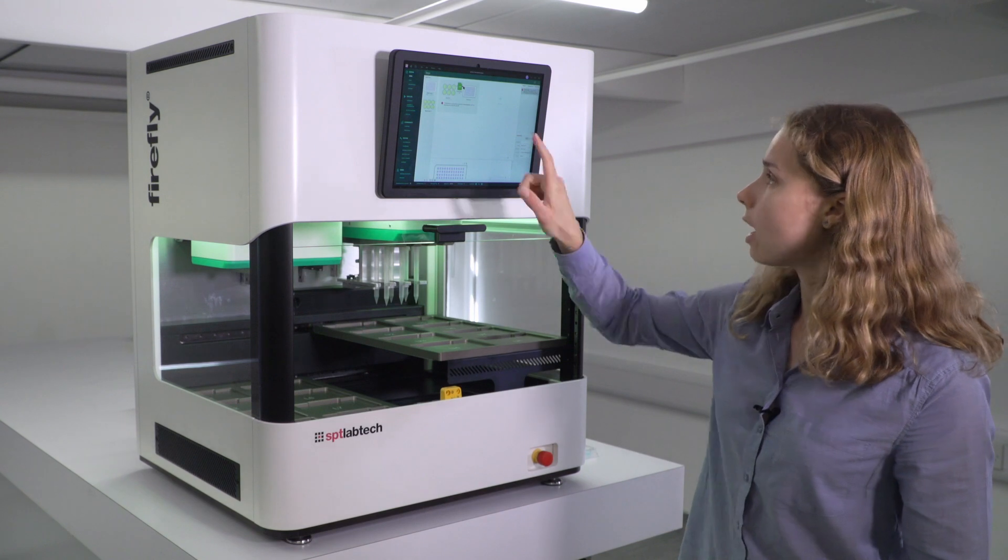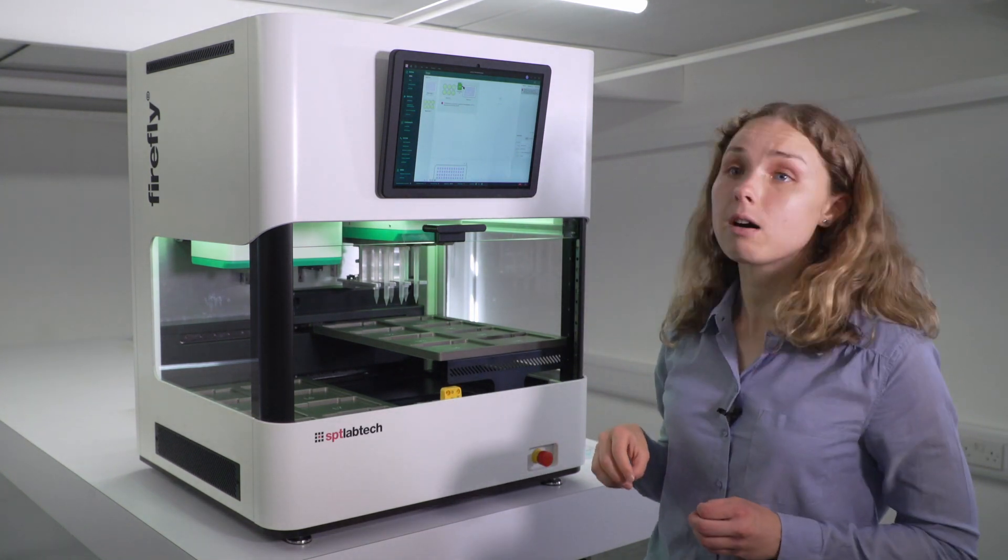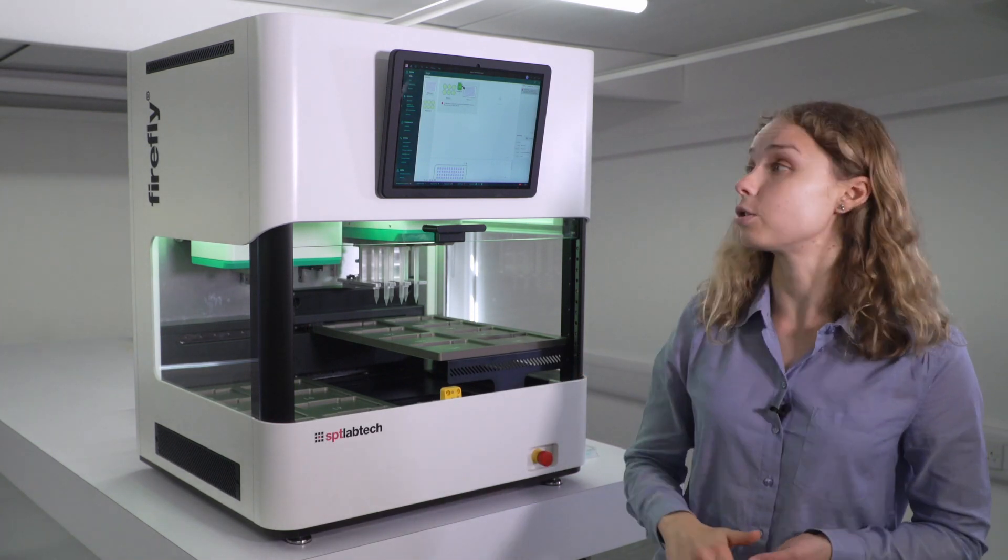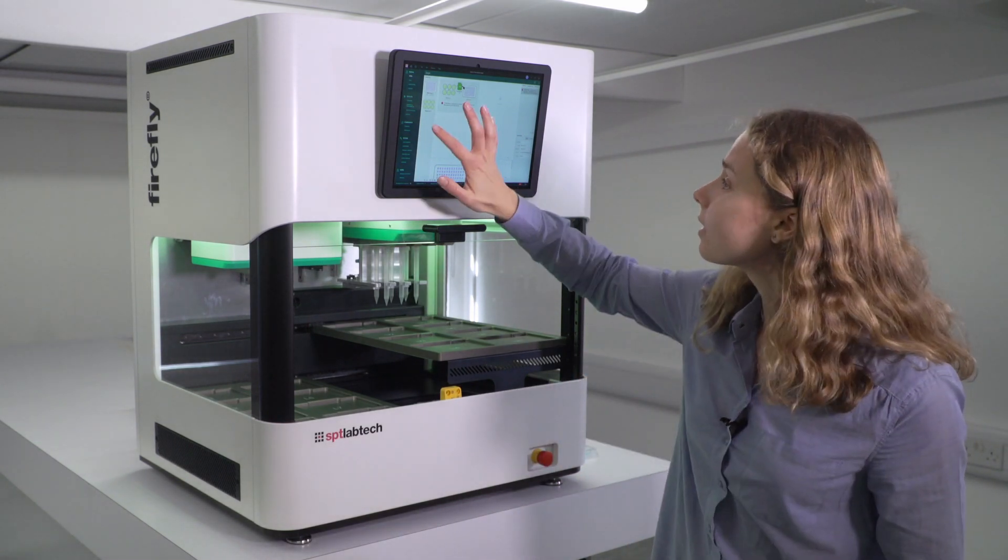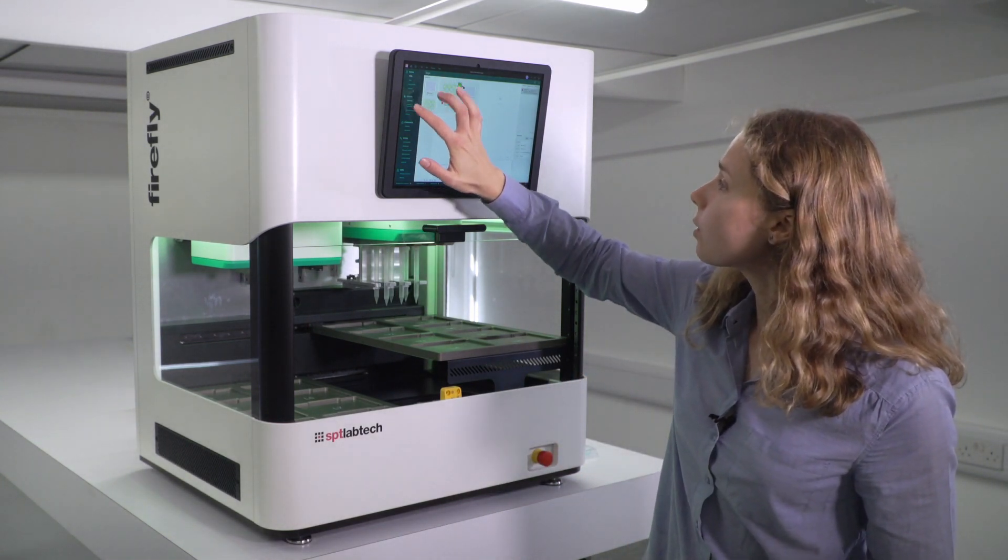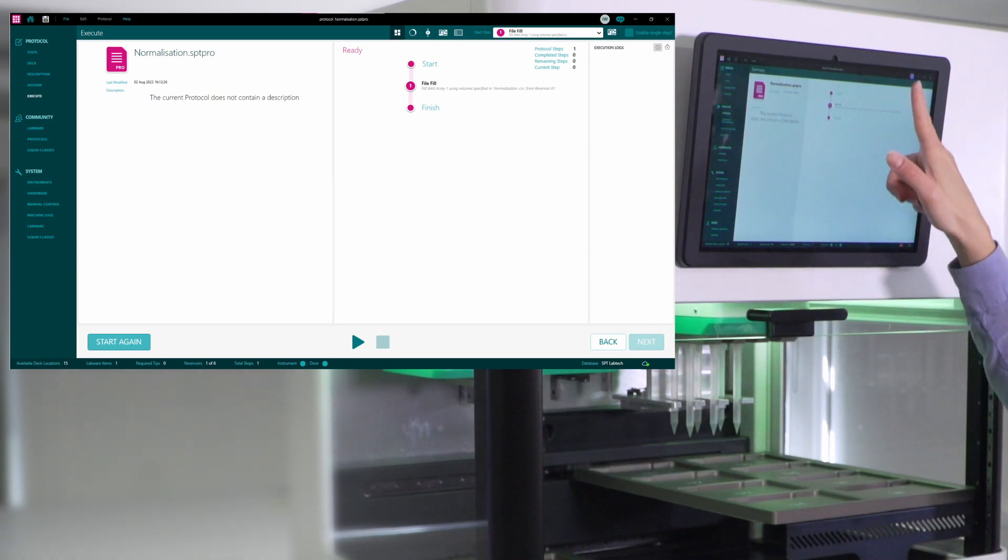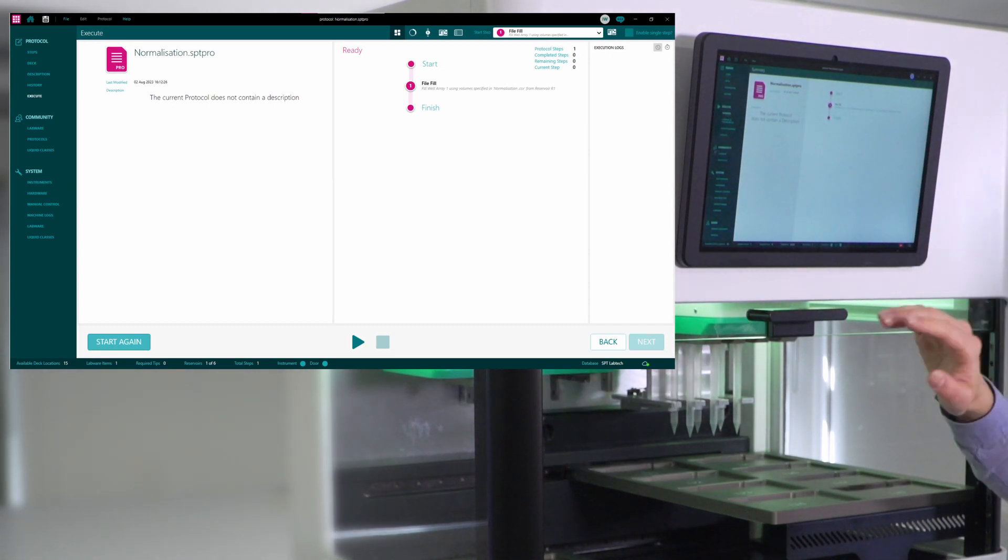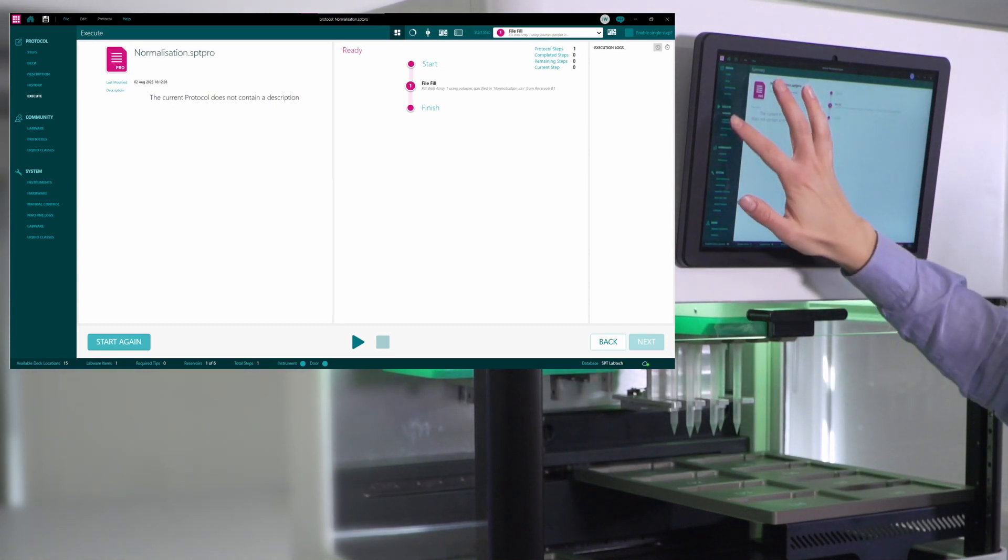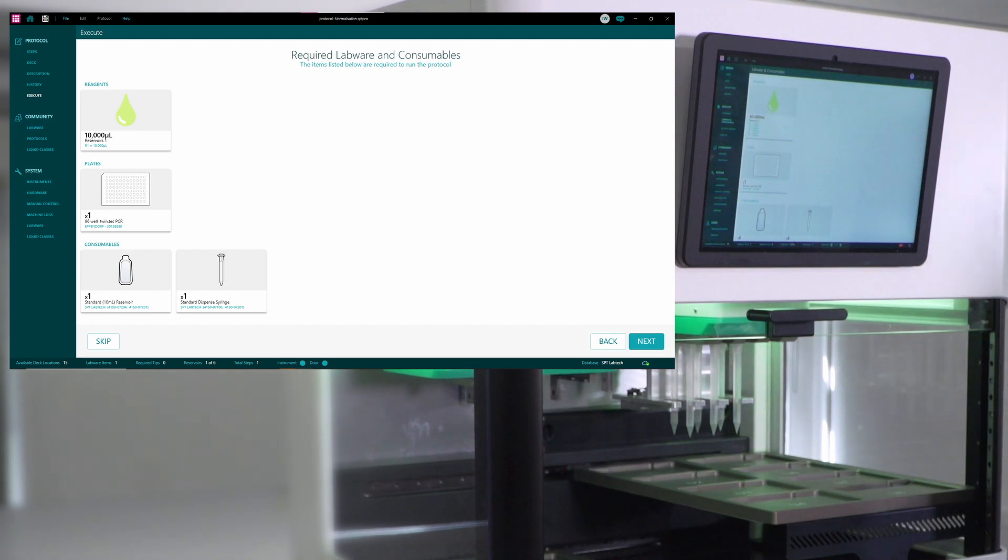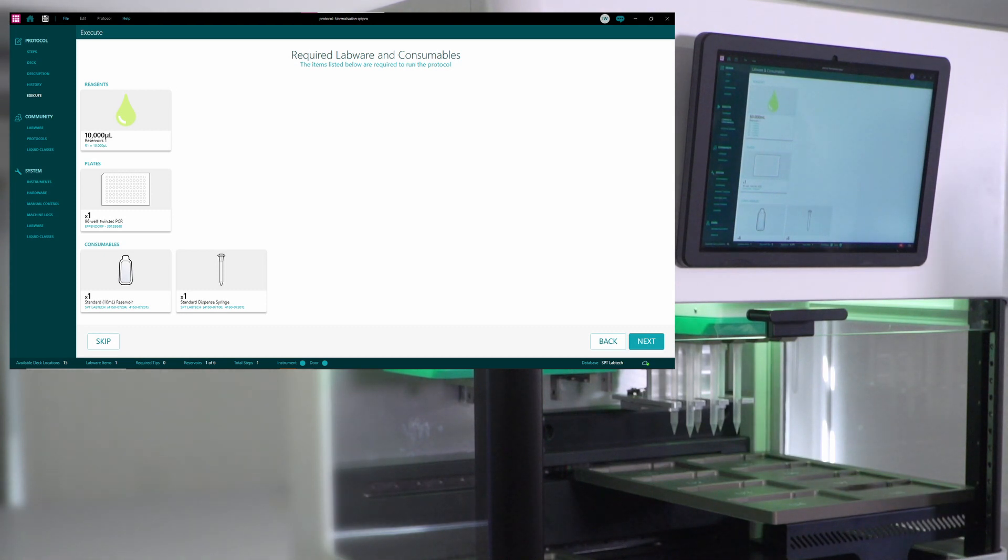So now my file is linked to the step. I can start setting up the actual instrument in order to do the run. It's quite useful to check out the summary to see all the steps that I included in the protocol. And the useful tab of labware and consumables will inform you of what exactly needs to be prepared in order to do the run so that I can come in already with all the labware in place.